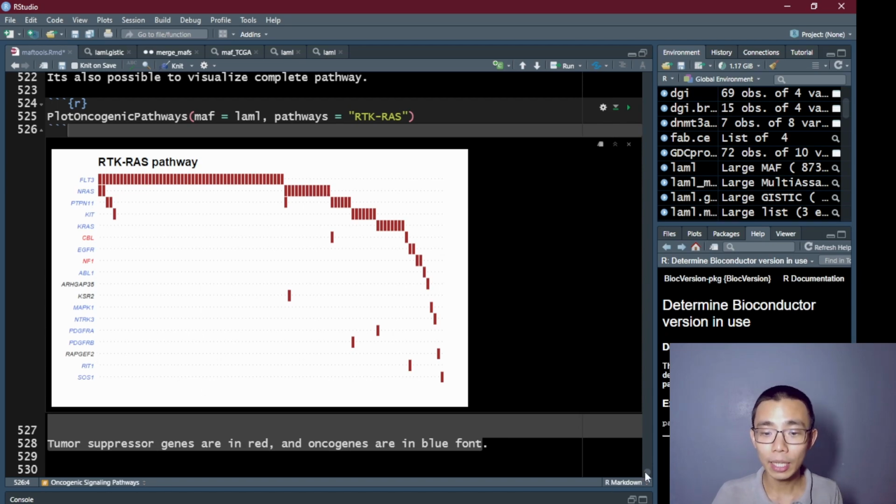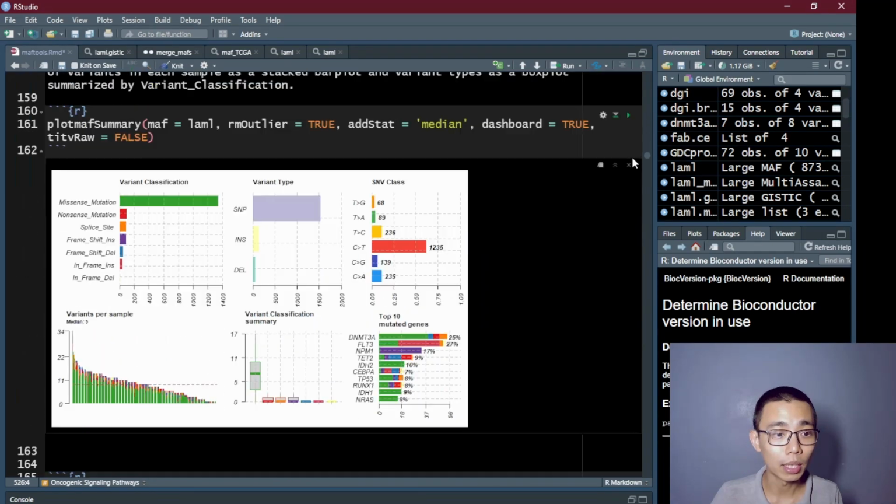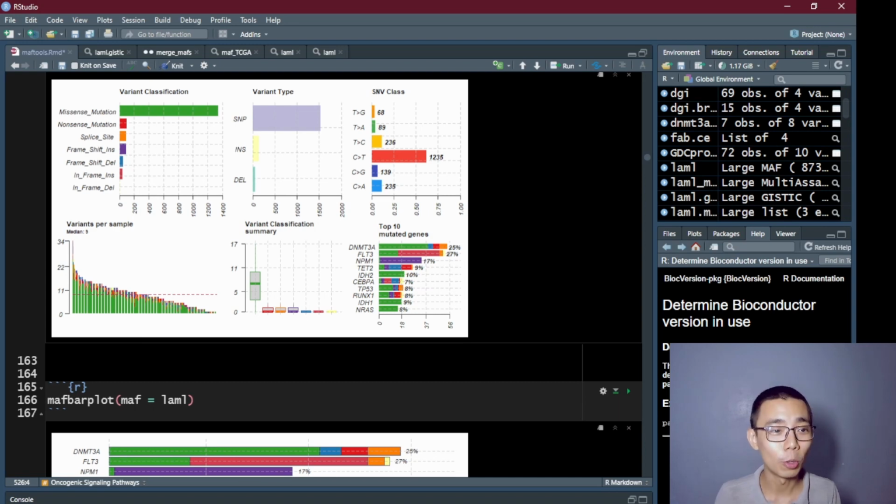And so on. That concludes the script for today, a quick look at the MAF file. I hope you learned something about MAF. It was a good experience for me to go through and look at the beautiful pictures generated from the data, and I actually found something that I had not found beforehand myself.